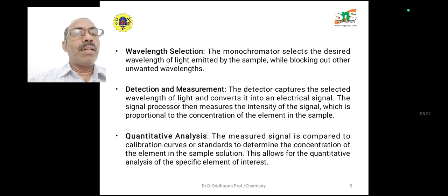Next we go for the analysis of the sample. The measured signal is compared to the calibration curves or standards to determine the concentration of the elements in the sample solution. So this allows quantitative analysis of the specific element of interest.